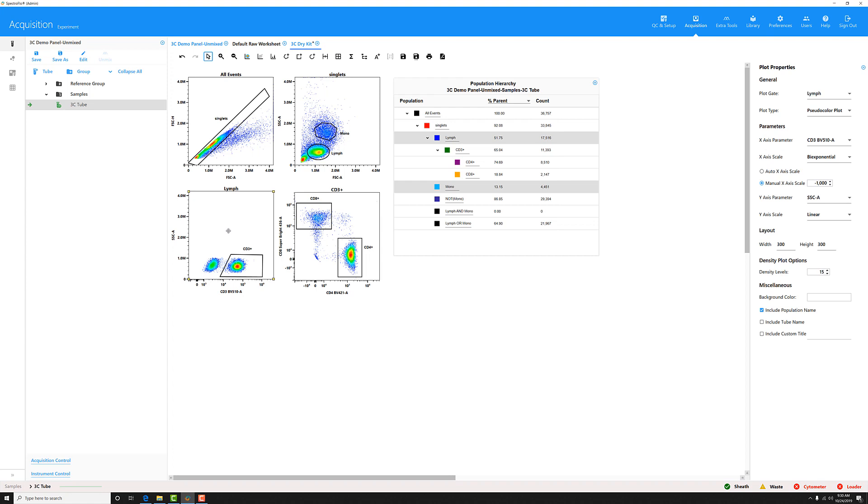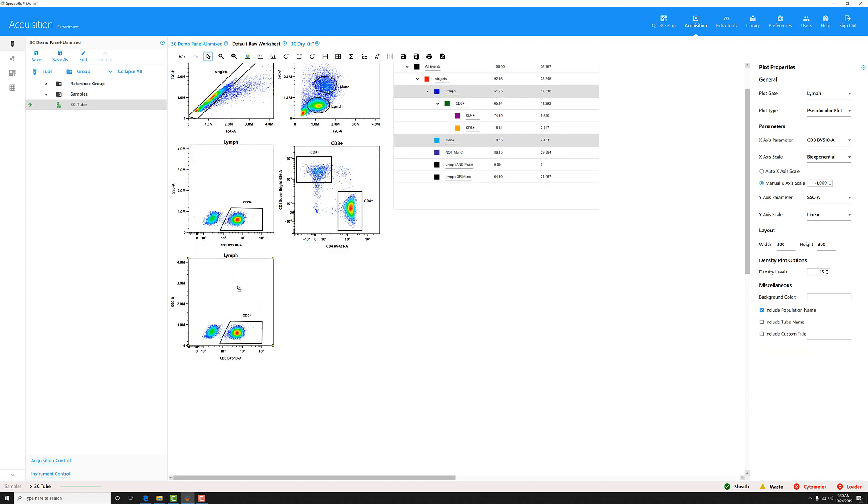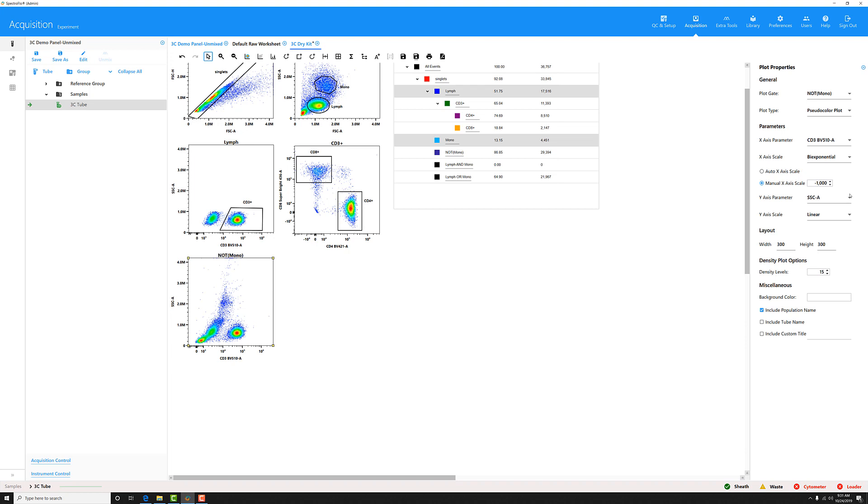If I want to display that population, maybe I can duplicate this plot here. Then again, in my plot properties, I can change the plot gate to any of the different Boolean gates I've created. So here's my NOT MONO gate.